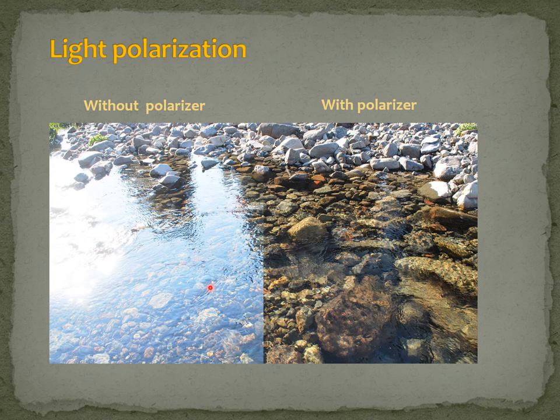Of course, this is due to the characteristics I've told you before: the reflection, the angle of incidence, and the refraction of light. So with the polarizer we can filter most of the undesired angles of light, and we can just focus on one single type of light being reflected from the pool, and it allows a better resolution of all the details.